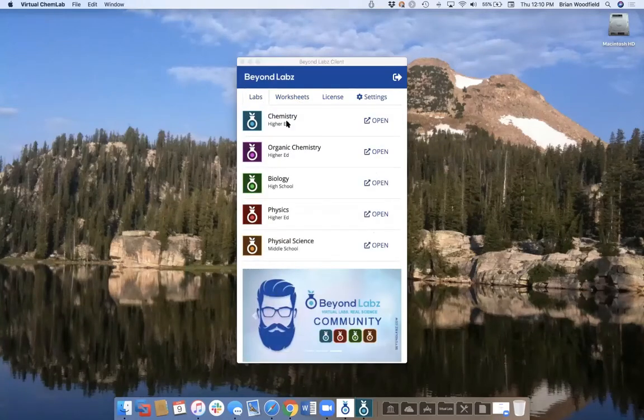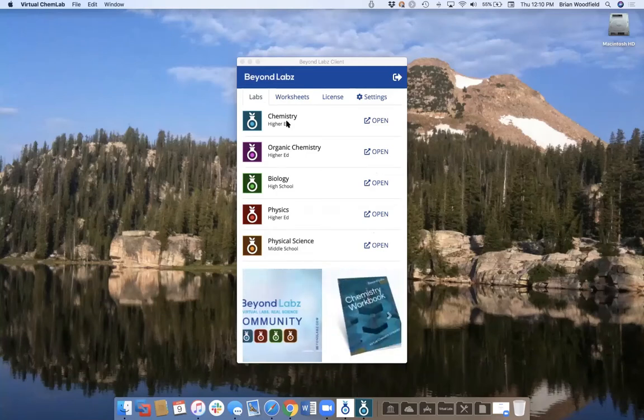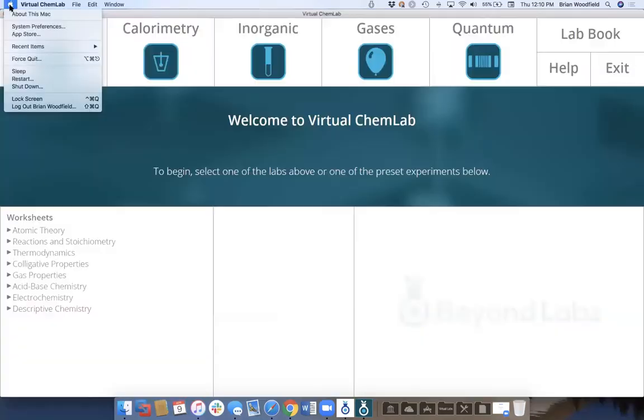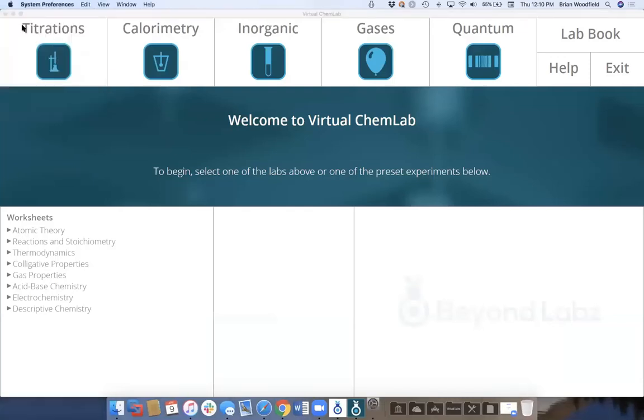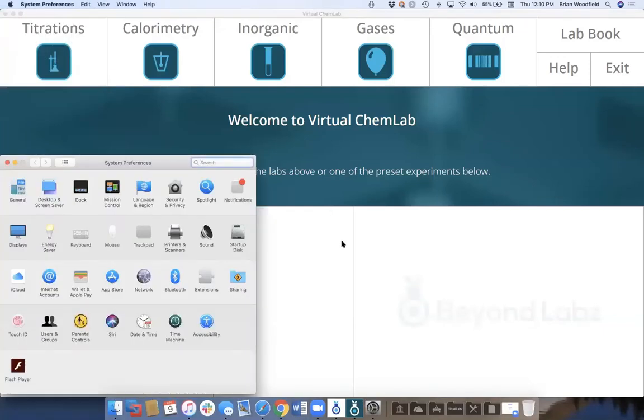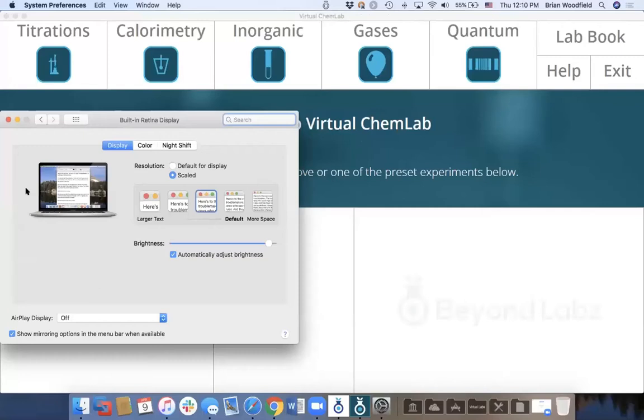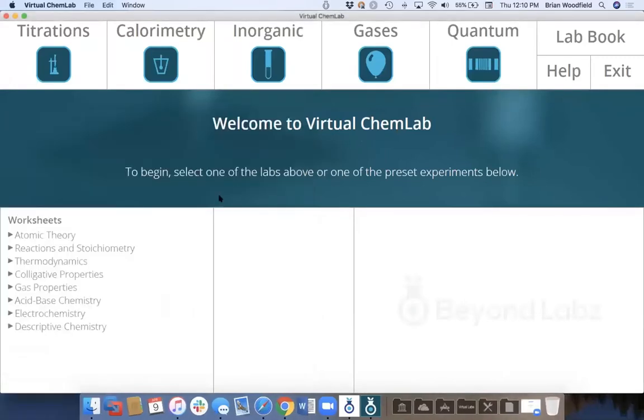So I'll go into general chemistry and launch it. I'm going to change my screen resolution because I have a pretty high resolution monitor. I'm just going to make it a little bigger so it's easier for you to see on the screen sharing.